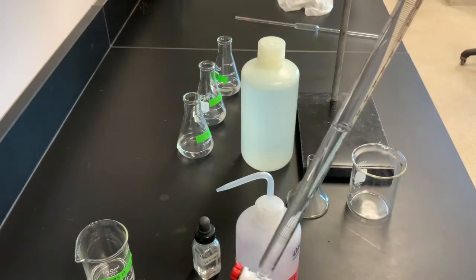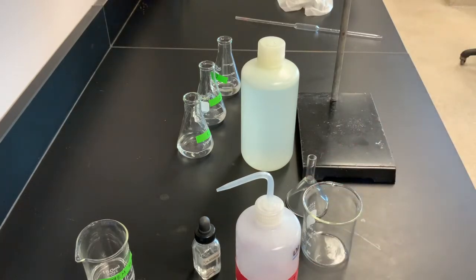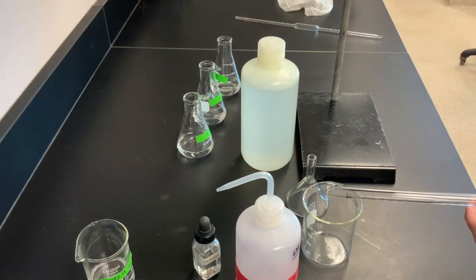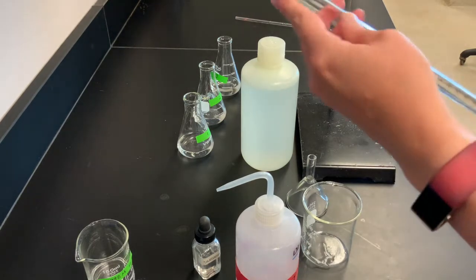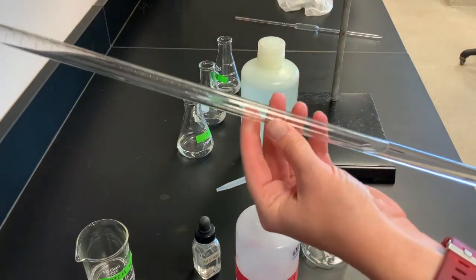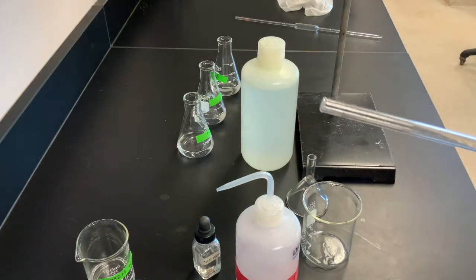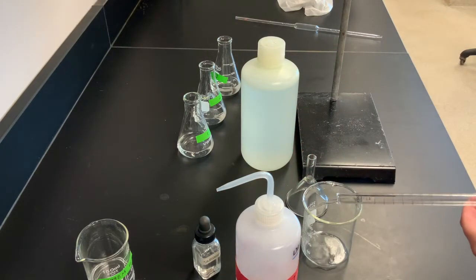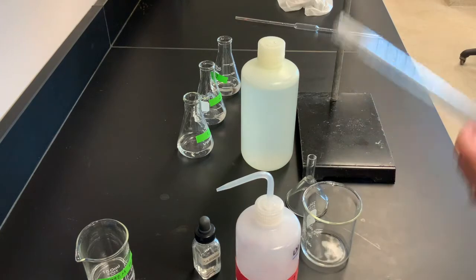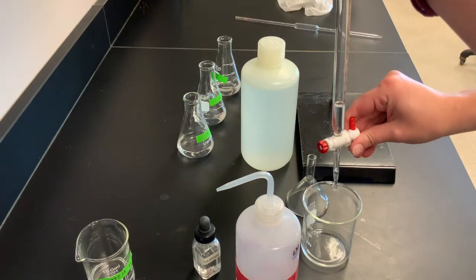So what we want to do is turn this sideways over a beaker. And we're just going to roll it around. As we're rolling it around, the water is able to coat the walls. So again, we're going to roll it around and dump it into the beaker. The other thing we want to do is let some run out the bottom.